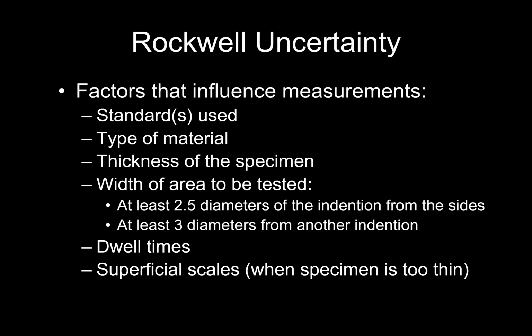Since it's measuring directly the penetration in the specimen, the thickness of the specimen is going to play a role. If your specimen is not perfectly flat, in particular, or is tilted, this will influence the penetration. So a lot of uncertainty with Rockwell that may not appear with the other two techniques, Vickers and Brinell, because they are only measuring a force or a pressure applied to the specimen.